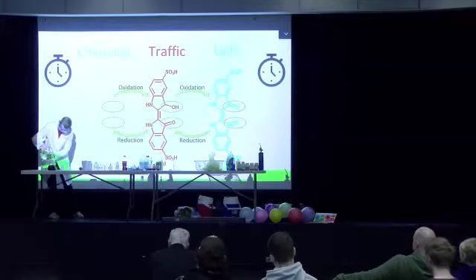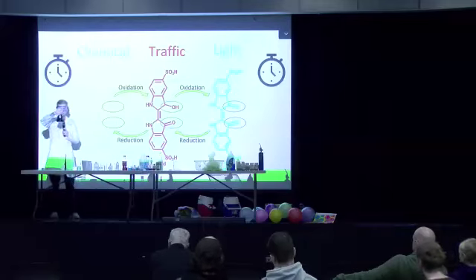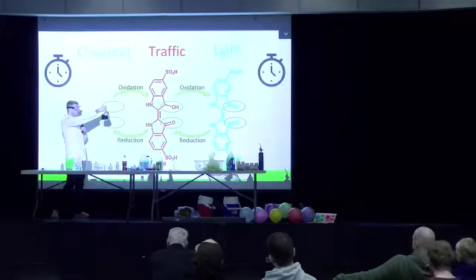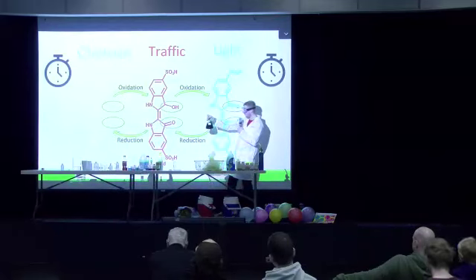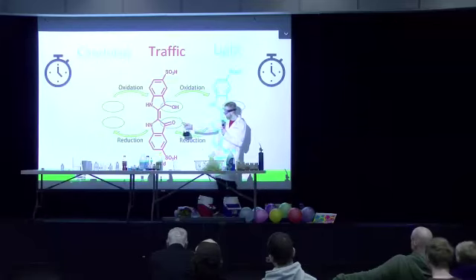All right, so it's kind of hard to tell for this one, but it's currently a green. And if we let it sit here, it's kind of turning blue right now, because it's going to be switching over to the red.